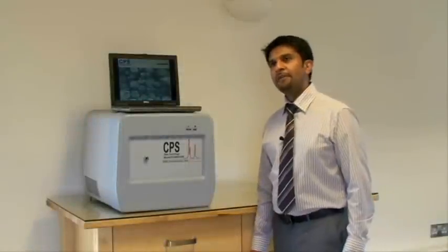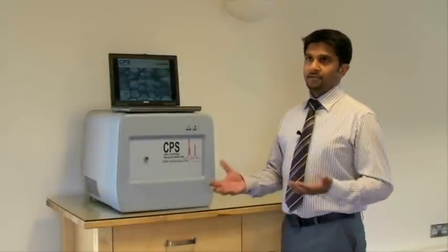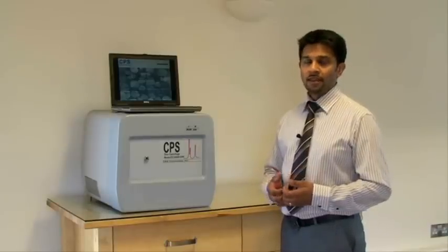So what are the main features and benefits of the instrumentation? As everyone will know, there are many other particle sizing instruments out there. I always like to say that these other techniques are very complementary and you should always use more than one technique when you're characterizing your material. When it comes to the CPS disc centrifuge, one of the main benefits you'll find is the ability to give ultra-high resolution.